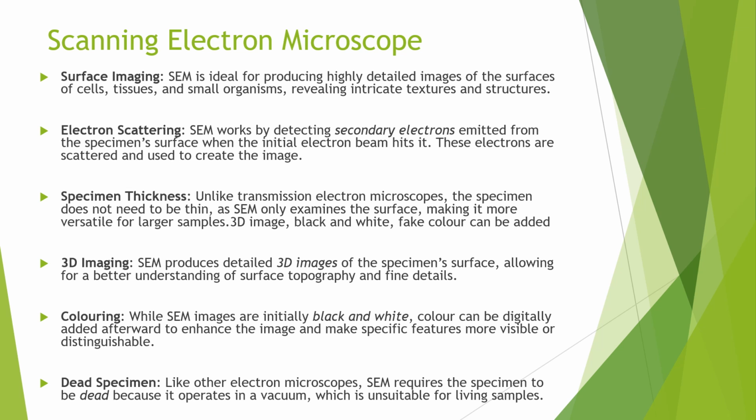In summary, the SEM is an invaluable tool for examining the surfaces of biological specimens with incredible detail and precision. Its ability to produce 3D images, work with thicker samples, and provide high-resolution imaging makes it essential for many scientific fields.